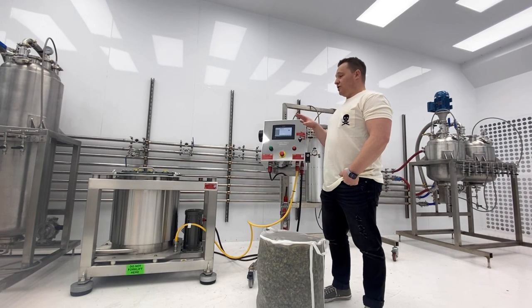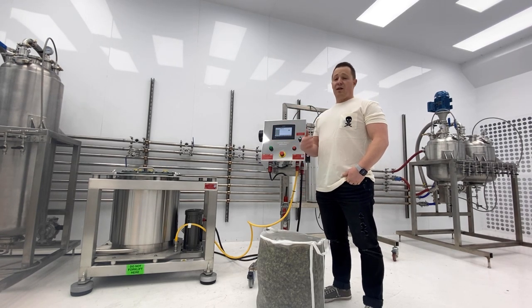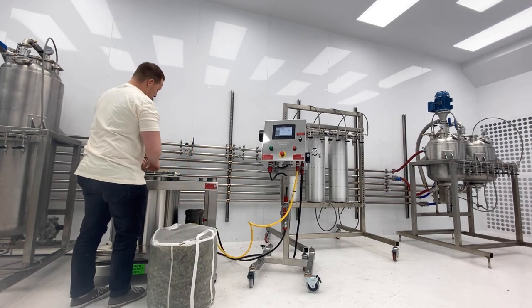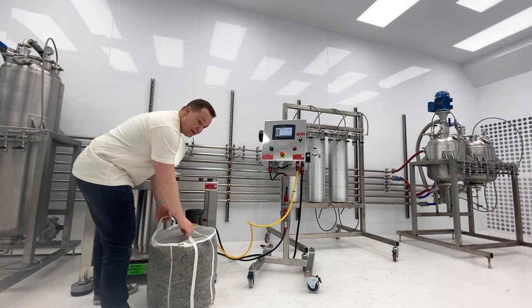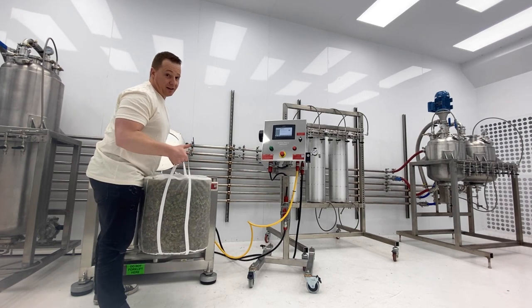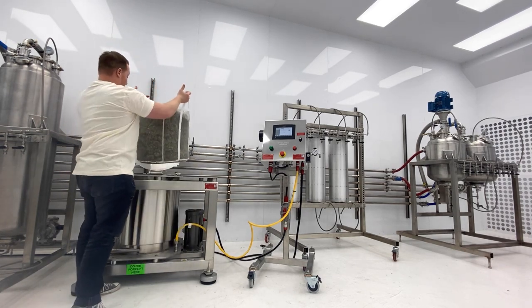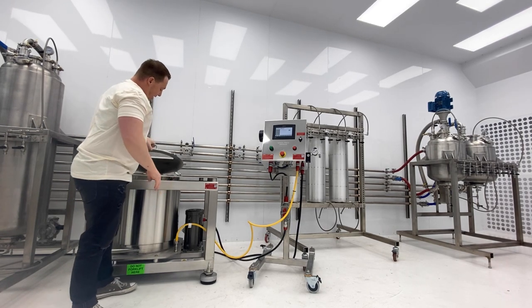I wanted to go over some key features of our EVMASS SC30 centrifuge. One of them is ergonomics. I've got a 30-pound bag of biomass here. Unlike some other units on the market where you have the basket up higher — which makes it quite difficult, especially for shorter operators, to load and unload — these bags can be fairly heavy at 30 pounds. Loading and unloading the biomass is relatively easy with the low basket on this centrifuge.